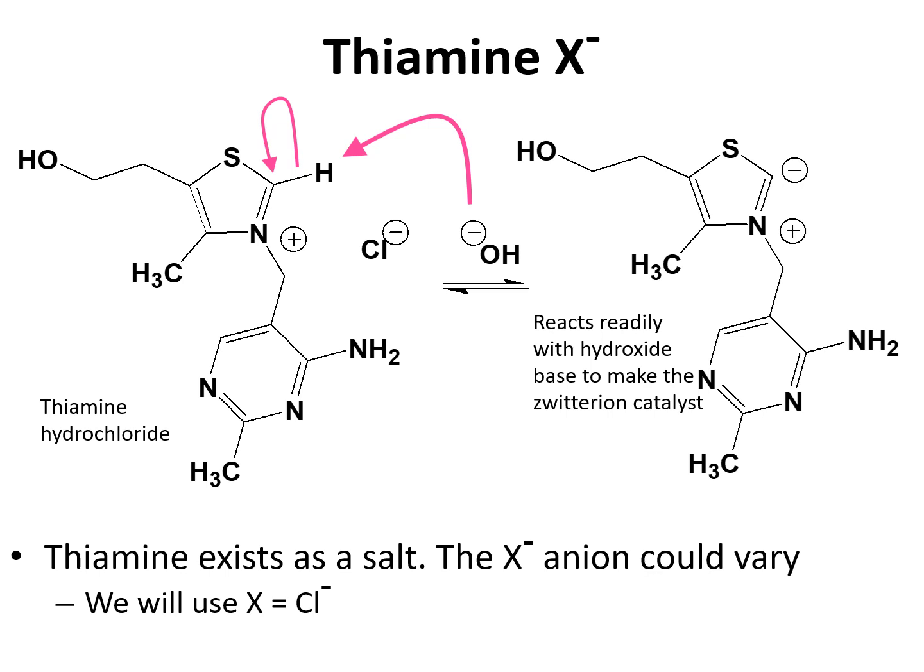So for thiamine halide in general, where X can be chlorine or bromine, for this experiment we'll be looking at thiamine hydrochloride specifically.